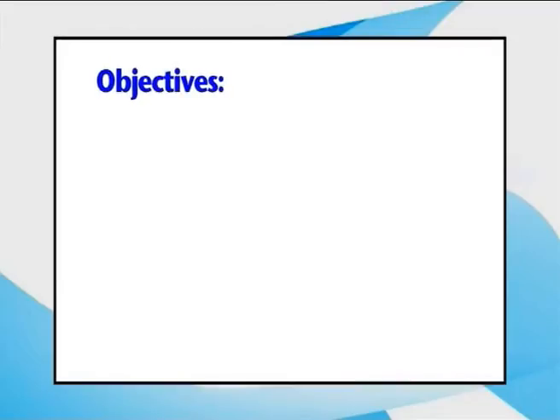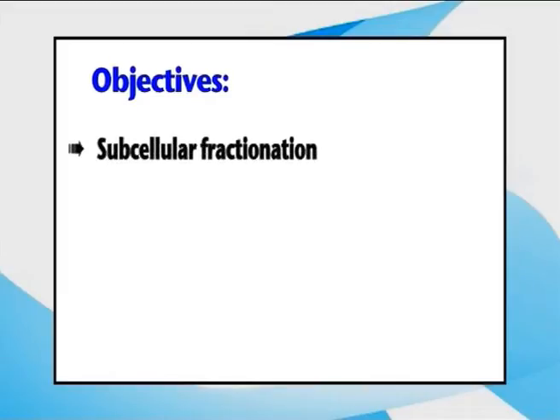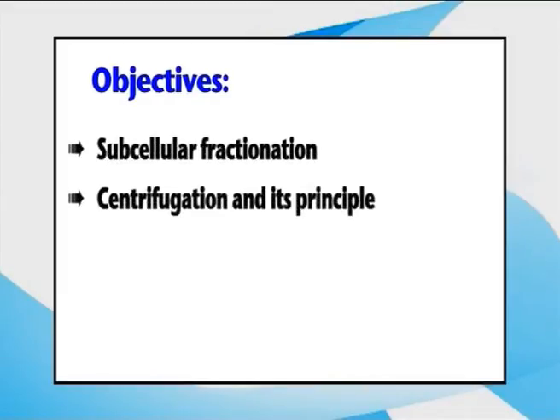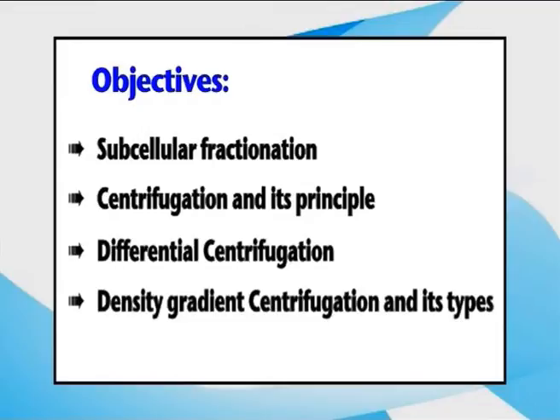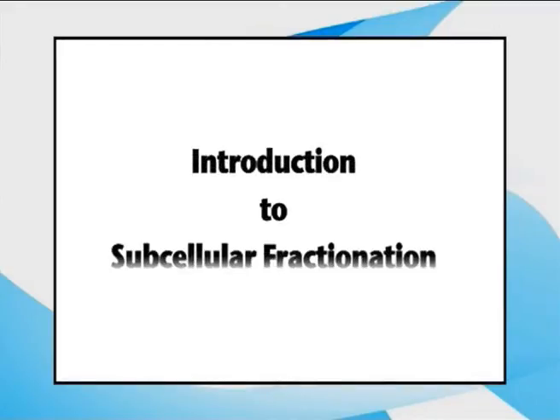Today we are discussing an important topic entitled Subcellular Fractionation, Differential and Density Gradient Centrifugation. Before discussing in detail the subcellular fractionation, let us first know its objectives. The objectives are to understand Introduction to Subcellular Fractionation, Centrifugation and its principle, Differential Centrifugation, Density gradient centrifugation and its types. Now let us begin with Introduction to Subcellular Fractionation.